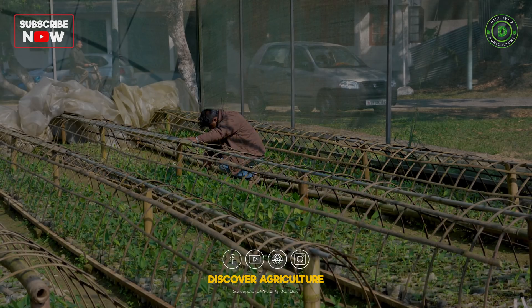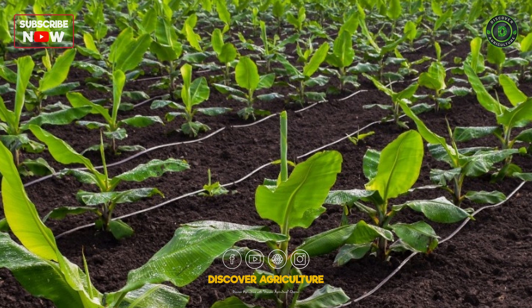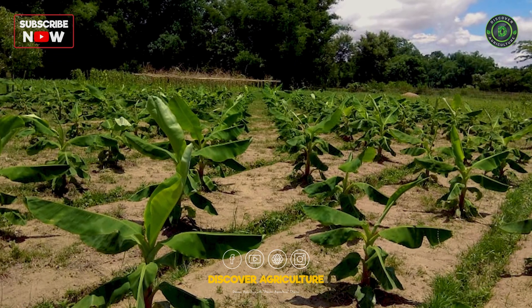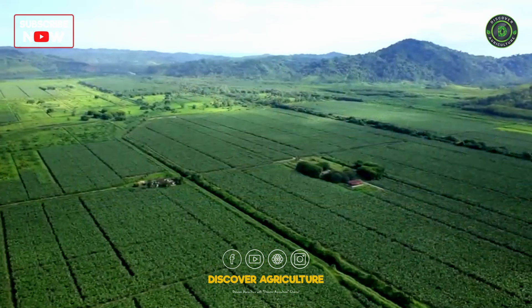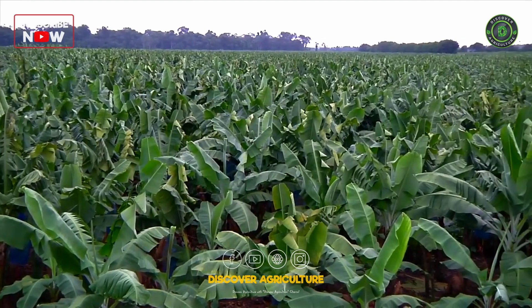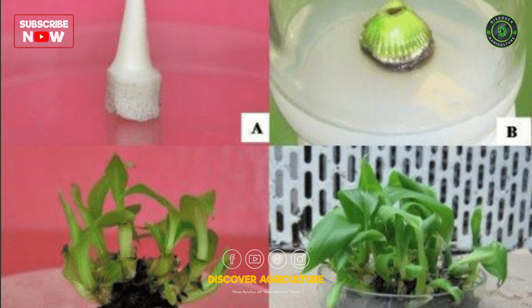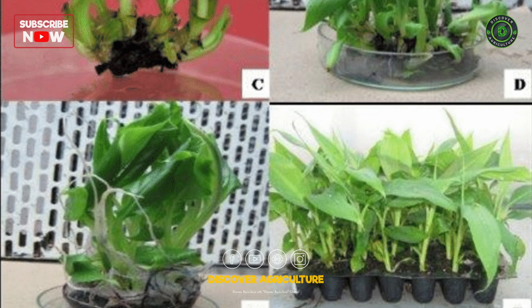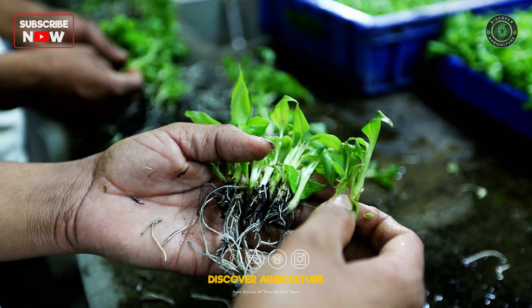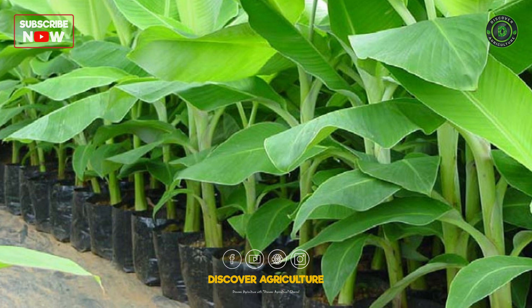Ready for the field. After the hardening process, the banana plants are ready for planting in the field. These micropropagated plants are disease-free and available year-round, ensuring a healthy, consistent yield for farmers. By using tissue culture plants, farmers can significantly reduce the risk of plant diseases caused by microorganisms. The micropropagation process is an efficient and highly controlled method of producing banana plants free from disease. By following these precise steps, we ensure that farmers receive healthy, robust plants ready to be grown in the field.